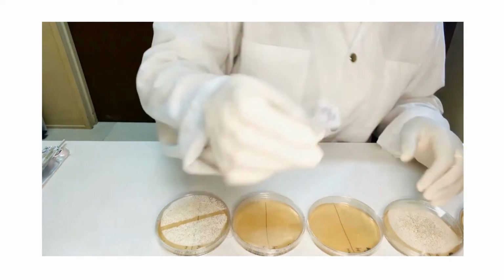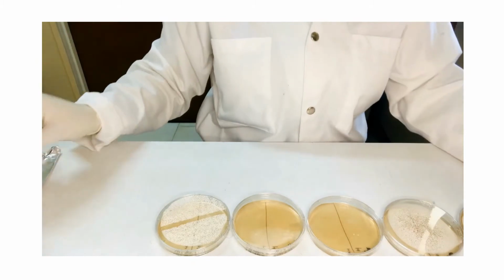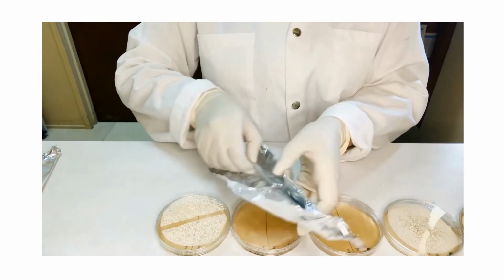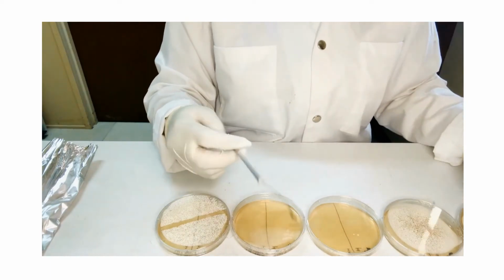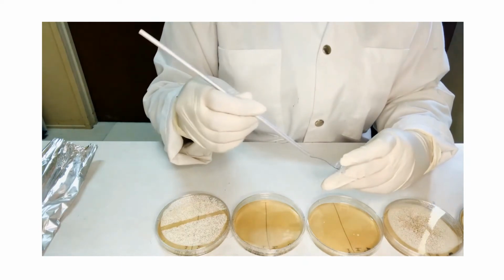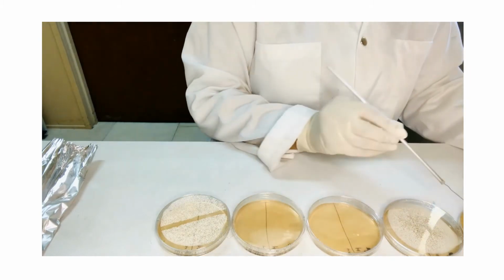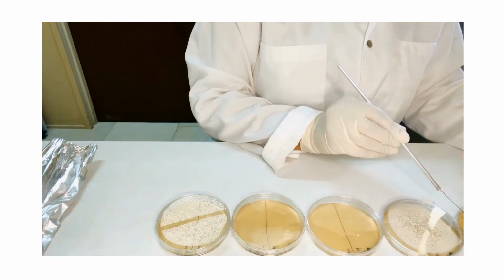Bacterial strain 1 is contained within the centrifuge tube. The handle end of the loop's wrapper is opened and the sterile loop is then removed. The cap is removed from the strain 1 broth culture bottle. She then proceeds to dip the sterile loop into the strain 1 culture. A loopful of strain 1 bacterial cells has been collected, and she then begins the inoculation process.